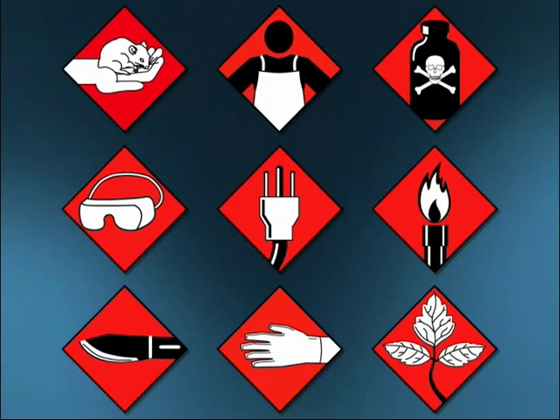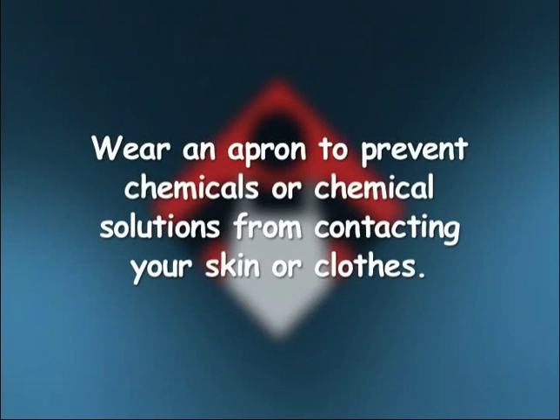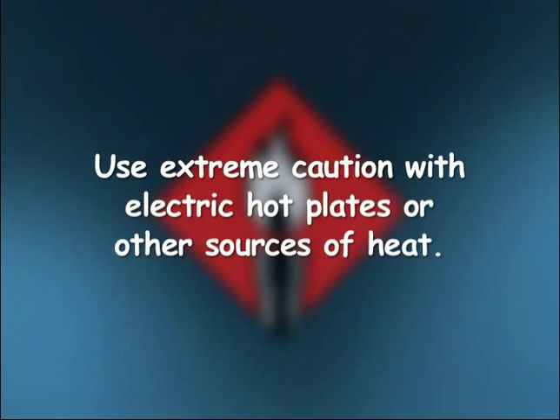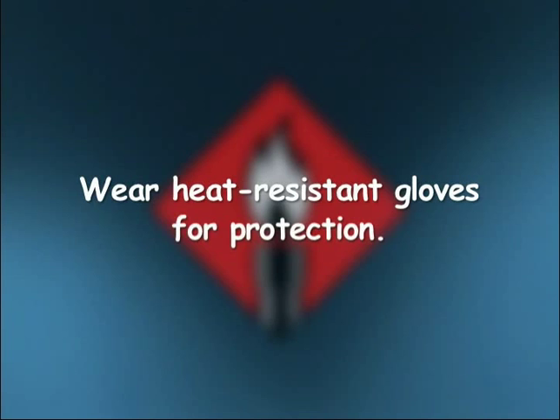Before beginning any lab, always review the safety symbols that are shown in your textbook. Wear an apron to prevent chemicals or chemical solutions from contacting your skin or clothes. Protective gloves are required for performing this lab. Use extreme caution with electric hotplates or other sources of heat, and wear heat-resistant gloves for protection.